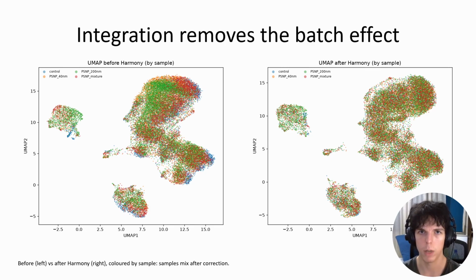Both pictures are a UMAP. Each cell has thousands of genes, and UMAP squashes that down to 1 dot on a map, so cells with similar gene activity land close together. The axes are just map coordinates, only closeness matters. Each dot is a cell colored by sample. I want the colors well mixed. If cells clumped by color, the sample would matter more than the biology, which is a technical artifact. Here they're nicely blended, so cells group by cell type, not batch.